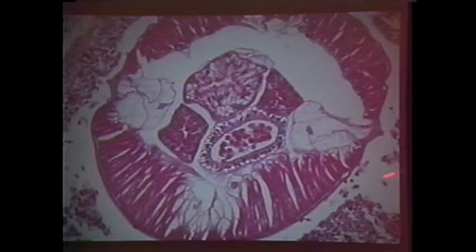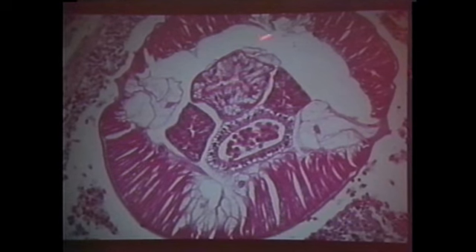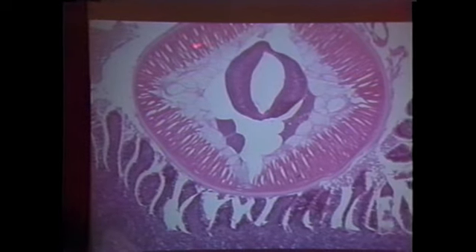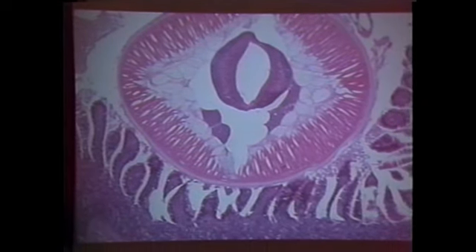This is Ascaridia. Notice the muscle is coelomyarian. You don't have that flat thing, and it's a female. Okay? This is Baylisascaris. See, this is definitely not platymyarian musculature.